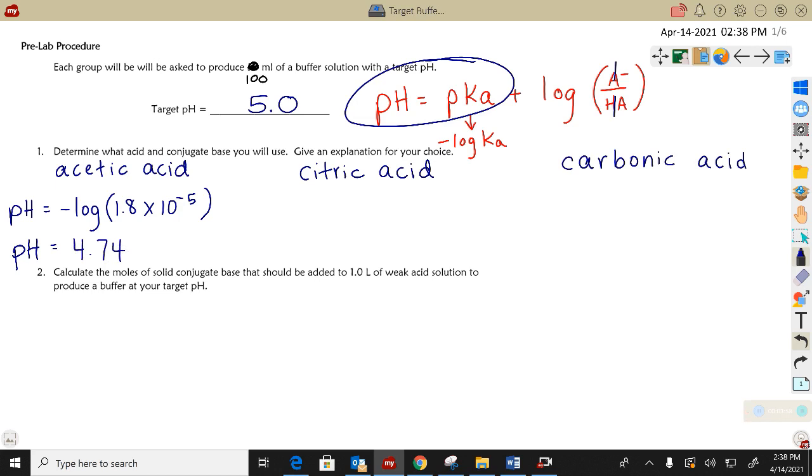Then my next option is a citric acid buffer, where I would have citric acid solution. If I look at the materials list, we would have sodium dihydrogen citrate, which isn't a real big deal. The key is just that it would only have 1 hydrogen removed from the original acid.